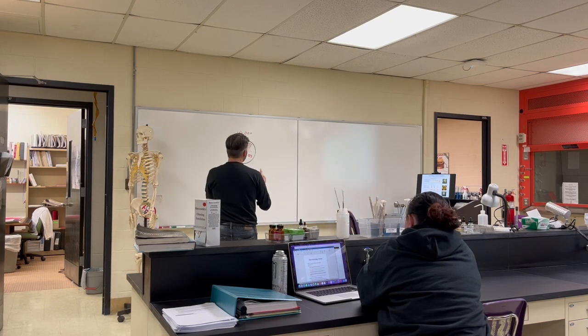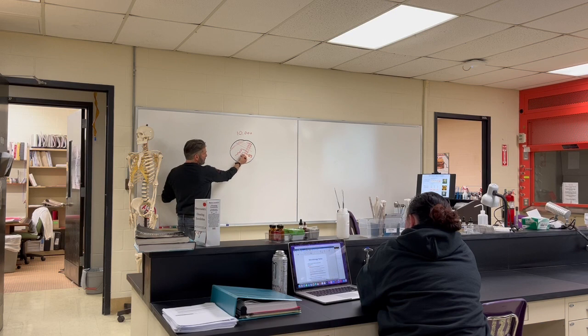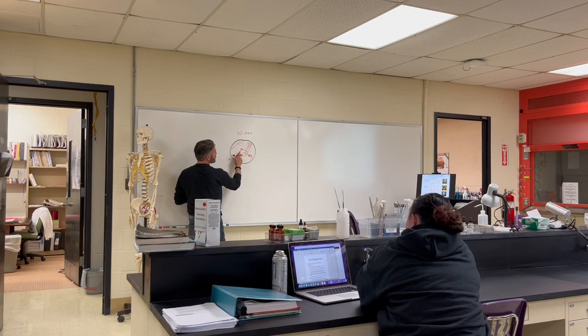Sterilize again. Come over, and now you can do whatever you want with this. I'm going to just draw through here and kind of do that. Draw through here and kind of do that. As I swipe it through here, I picked up 1 or 2, came down here, and hopefully I dropped one off here. One was here, one was here, and one was here. So now, next week when I come back, in theory, this should be from one bacteria, this should be from another bacteria, and so on. The swab ones you won't see.